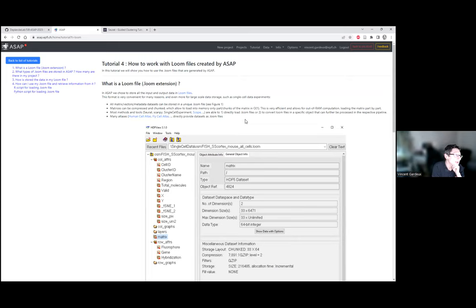Can we implement maturation directory as well? What do you mean by maturation directory? I'm not sure. Yeah, you mean like trajectory analysis or stuff like that? Trajectory analysis is something we originally had, and it was a nightmare to work with. Especially in our lab, we have Walter Salens, a postdoc in our lab. I don't know if you know the paper from Walter, where he compared, I don't know, 50 different trajectory methods. So we have this expert in the lab, and we discussed a lot with him.